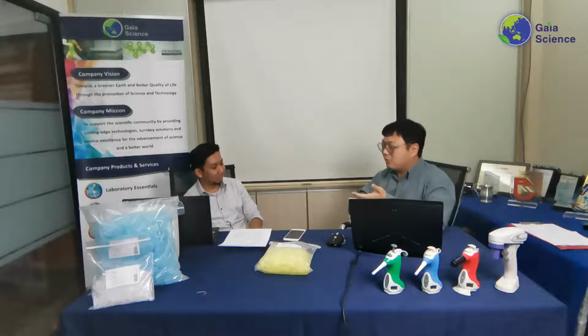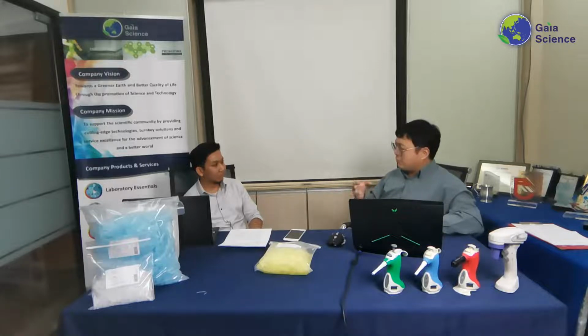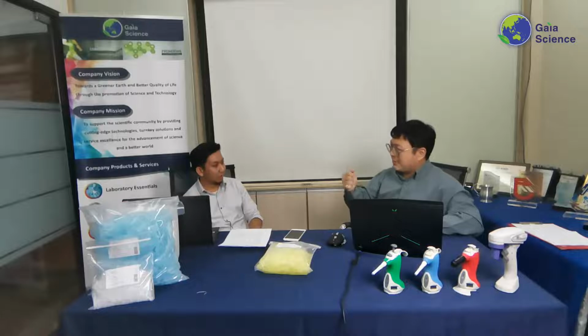Doesn't matter whether it's sterile. Even if it's a non-low retention or normal tip, the sample might go in and then you cannot get it out. You're dead. So the low retention one helps you aspirate exactly, and after that dispense exactly the right amount. So that's a big selling point.